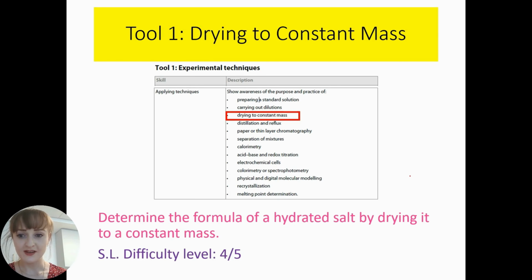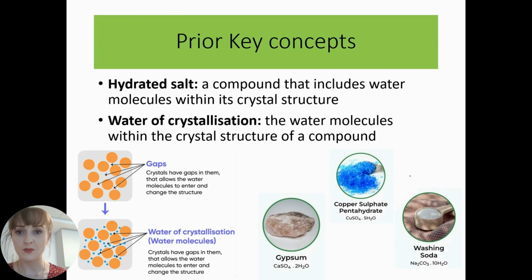As part of Tool 1, it is expected that you would be able to determine the formula of a hydrated salt by drying it to a constant mass. Before we begin, there are some key concepts that will be helpful for you to understand. What is a hydrated salt and what is water of crystallization?